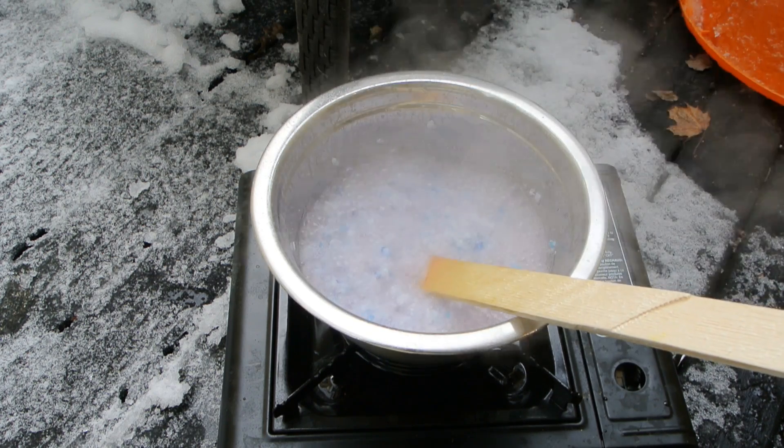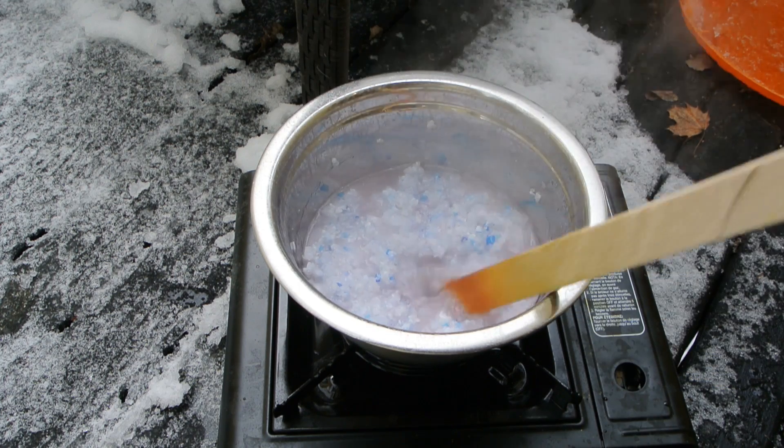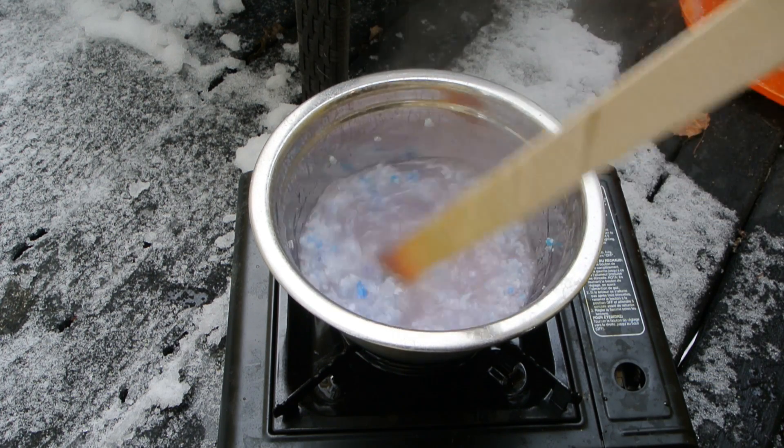Okay, now it's starting to boil - I'll turn it down a bit and really get the rest of this dissolved.